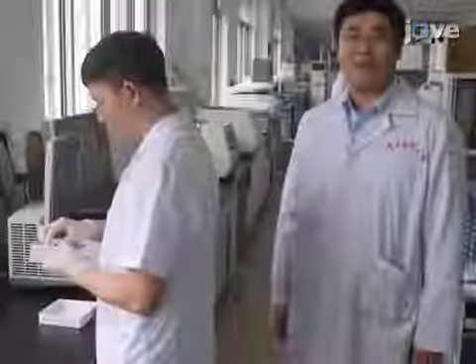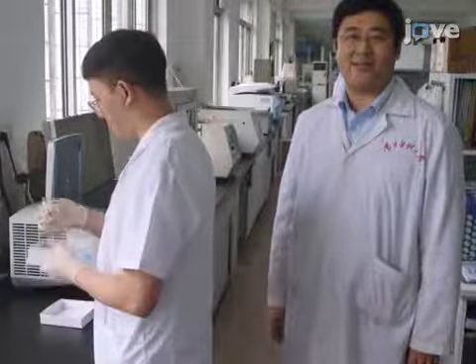The implications of this technique extend the applications of the described expression strategy to investigate mosquito biology, because this method allows for easy transduction of larvae. Demonstrating the procedure will be Pei-Wen Liu, a doctoral candidate from our laboratory.